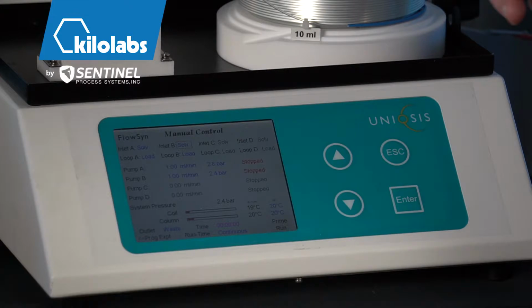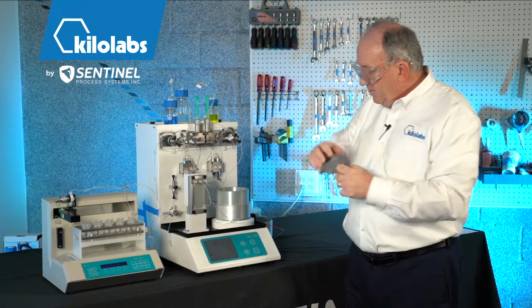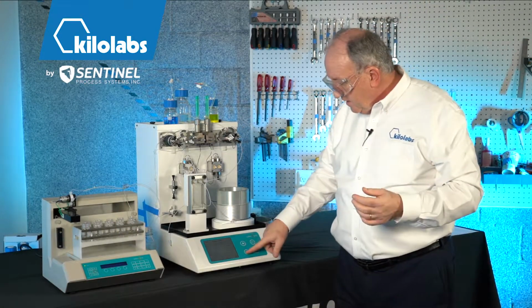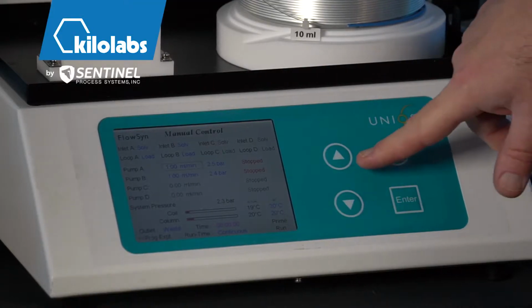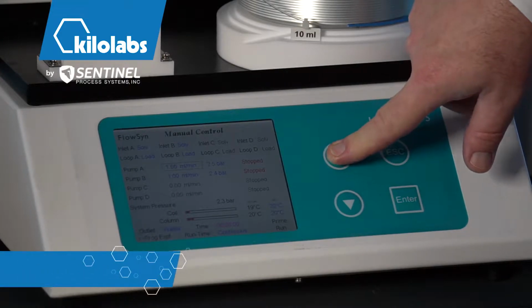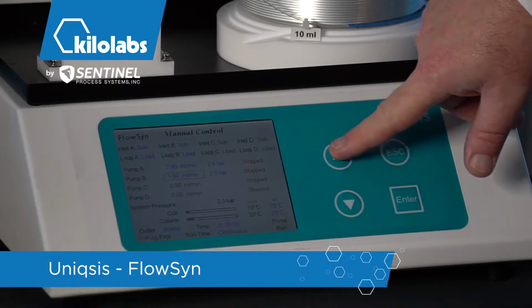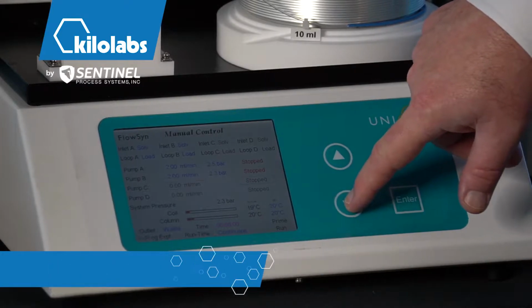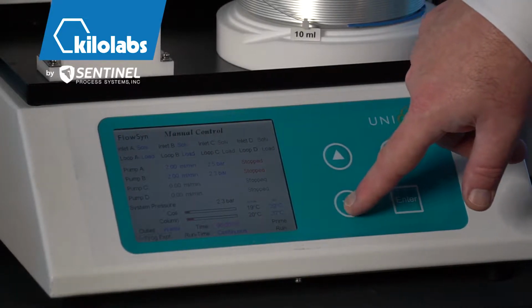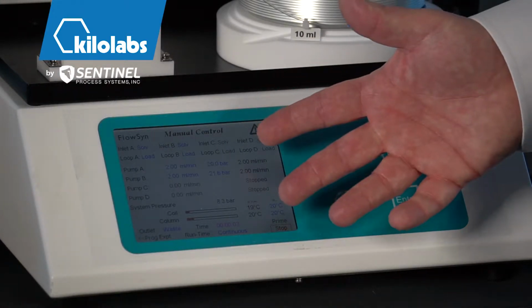So you'd use these switching valves here for priming the pumps with these syringes, and you're in essence pulling the liquid through to the high pressure side of the pump to make sure that it's hydraulically filled and you're ready to go. So then if I come all the way down, I can set these pumps manually at whatever rate I want. So I'll set this up to 2 ml and do that again for this other pump up to 2 ml. Then come all the way down to run.